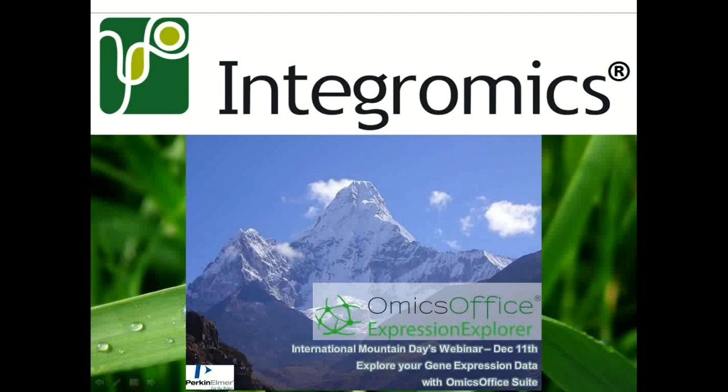International Mountain Days webinar. We will try and go through the OmicsOffice ExpressionExplorer, which is a tool we provide that will help you to navigate through those mountains of data that are accumulating in the hard drives nowadays.